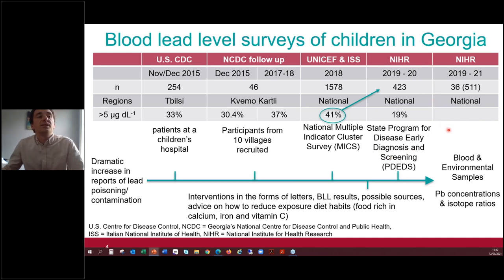This came a little bit later, and we only looked at 36 households here. But instead of just looking at the blood lead levels, we also took some environmental samples, and we also looked at the isotope composition of the lead, not just the concentrations.